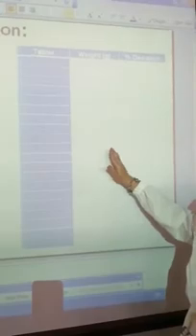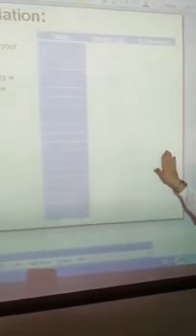So we have 20 tablets, each tablet weighed individually here. Then we will calculate the percentage deviation. How to calculate the percentage deviation? By subtracting the weight of the tablet from the average to get the deviation. Then compare the deviation with another table in order to judge that batch, whether it is accepted, suspected or rejected.